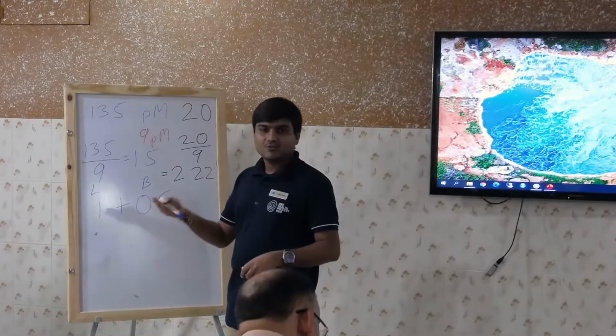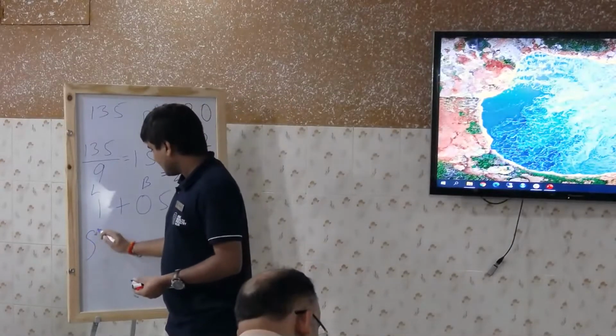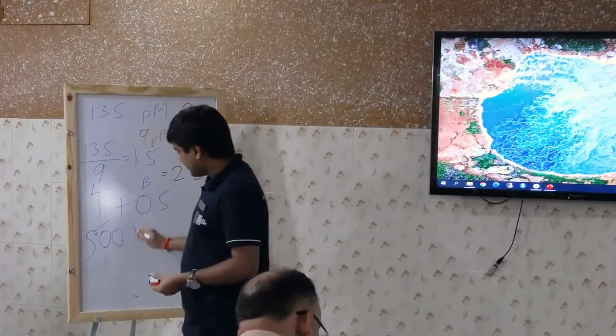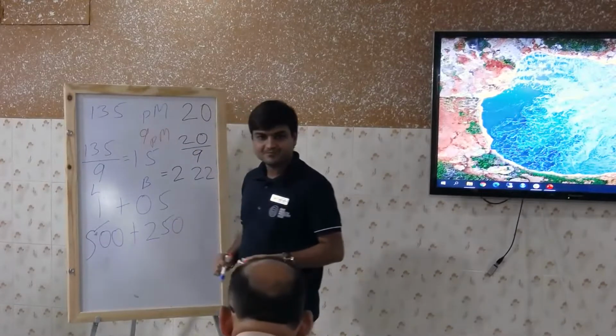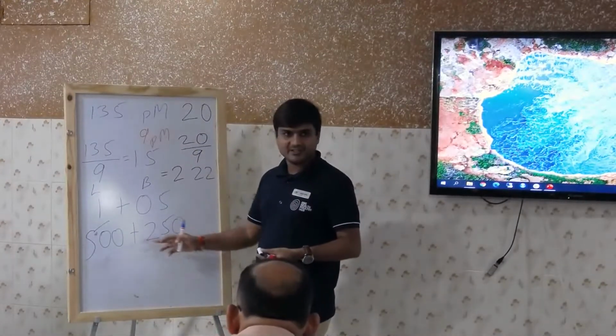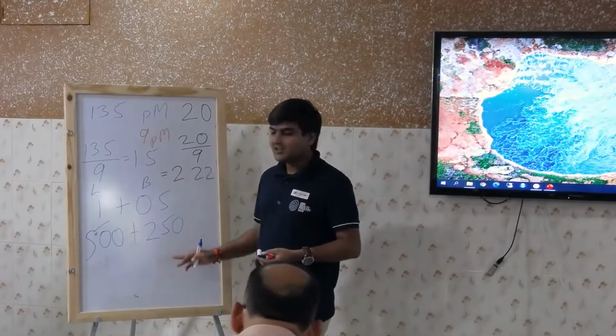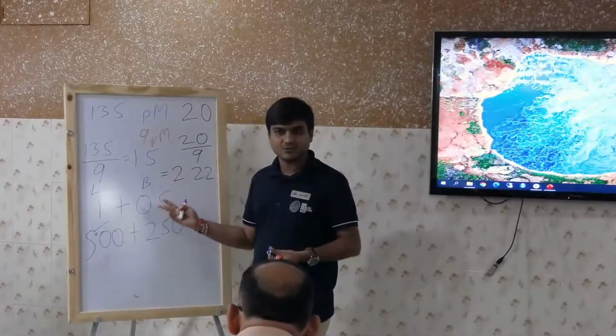500 microliter of library plus 250 microliter of buffer, 750 total. I am fulfilling all my conditions. I am getting exact numbers, the minimum volume is also 650, more than 650, and final concentration is 9 picomolar.